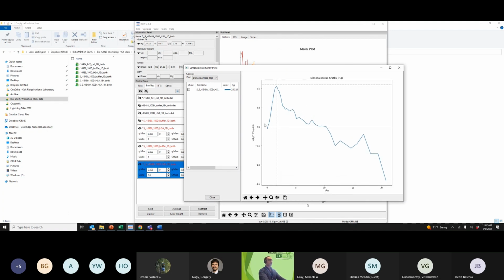As I said, for globular particles you see a maximum of the Kratky plot around 1.1, at around 1.73 on the q times Rg axis, which is the position where we should expect it. When you start to see deviations of this position, it is because there is some flexibility in your system. So it's a good way to compare different scattering profiles and see if you have the sample in different conditions, for example. If there is any conformational change happening, it's a qualitative way to check that.